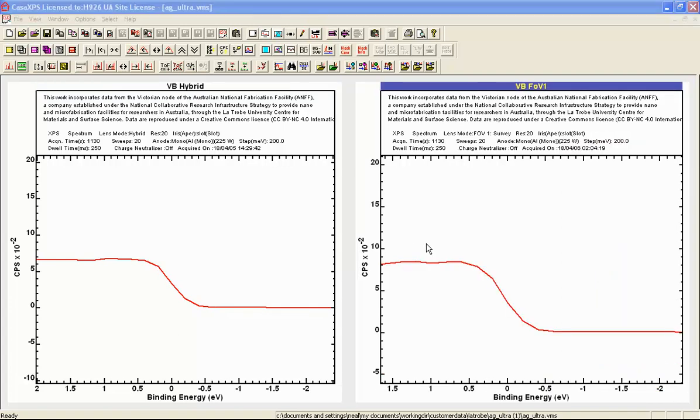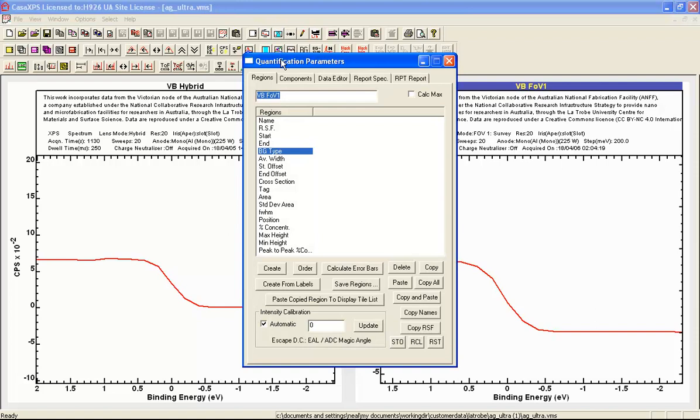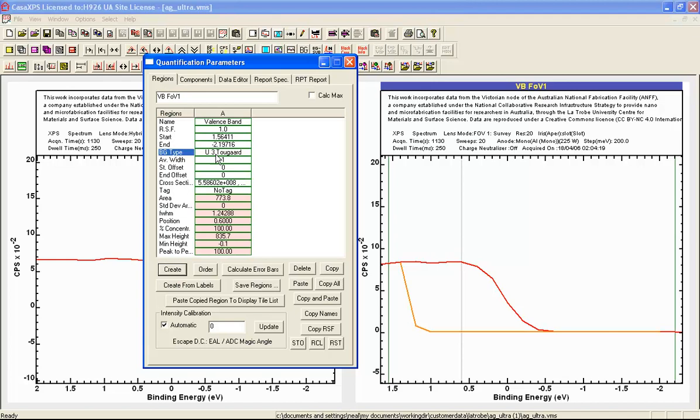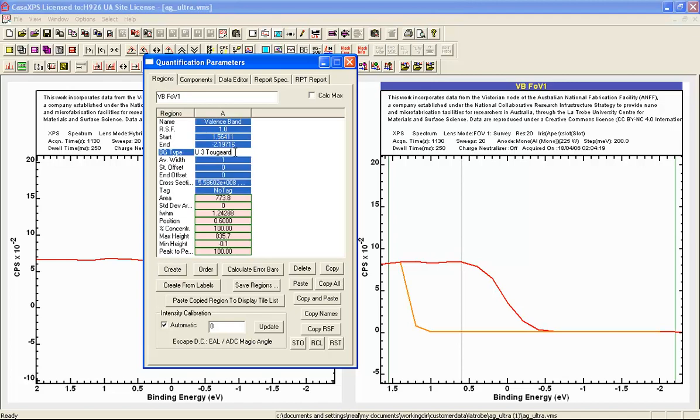To measure this edge we are going to use a background type. What we are going to do is fit a curve to these data and rather than using the components property page, the entire definition is within the regions property page as a background. So when I create a background, rather than using the default background that has come in, I can enter a background type that is ED, meaning edge down.